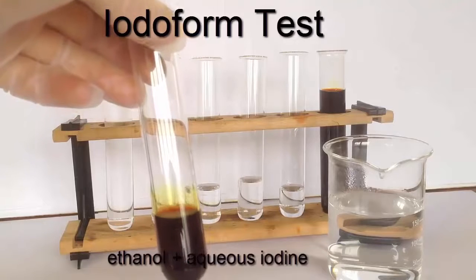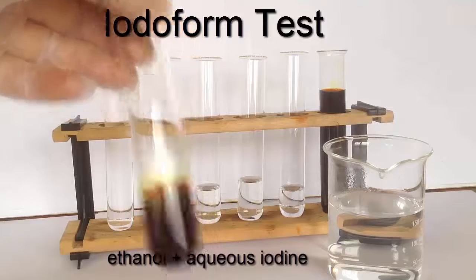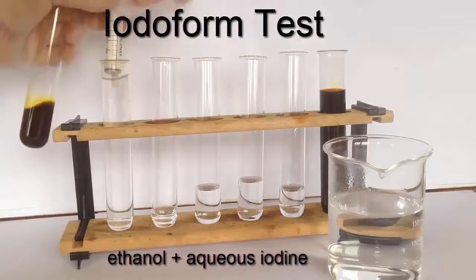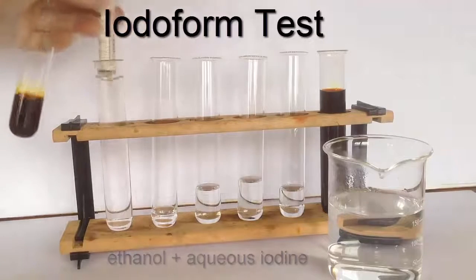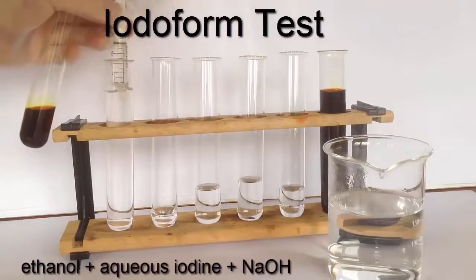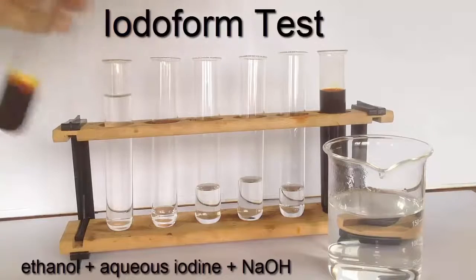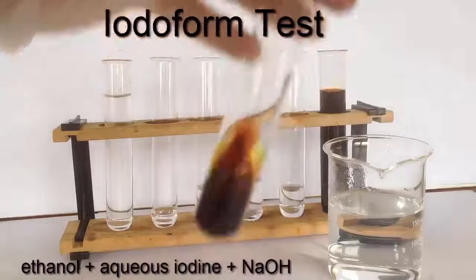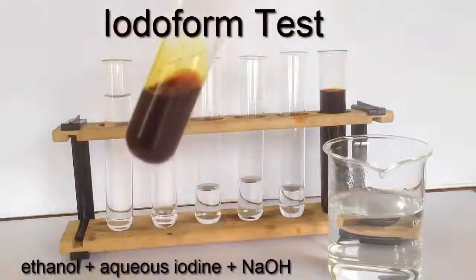And what the procedure requires me to do here is to add the 2 molar aqueous sodium hydroxide in a slow dropwise fashion. I'm using a small syringe here for convenience. And I keep adding the sodium hydroxide until the brown color of the iodine disappears, or just disappears. So I'm going to add the sodium hydroxide and shake it.